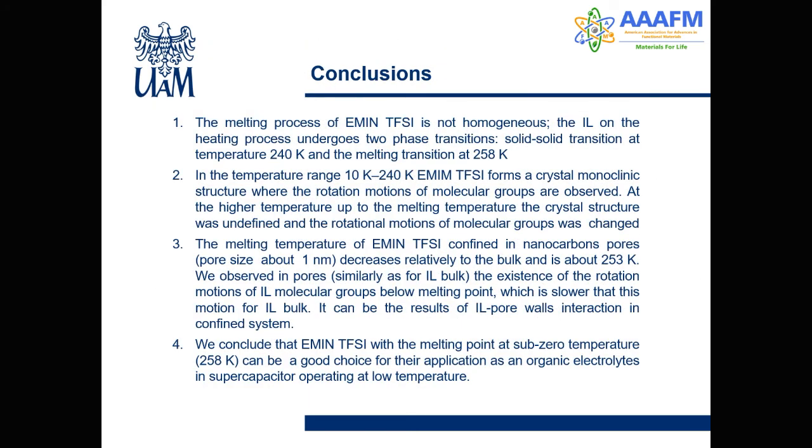As a conclusion, we could say that the melting process of EMIN TFSI is not homogeneous. The ionic liquid on the heating process undergoes two phase transitions: a solid-solid transition at temperature 240 and the melting transition at 258. In the temperature range 10 to 240, EMIN TFSI forms a crystal monoclinic structure where the rotational motion of molecular groups is observed. At the higher temperature, up to the melting temperature, the crystal structure was undefined and the rotational motion of molecular groups was changed. The melting temperature of EMIN confined in nanocarbon pores decreases relative to the bulk and is about 253 Kelvin.